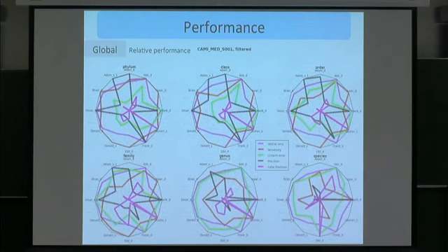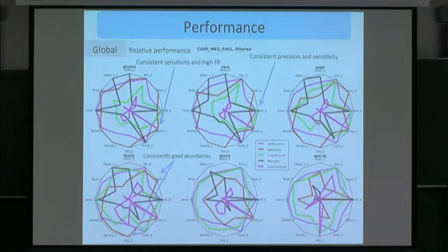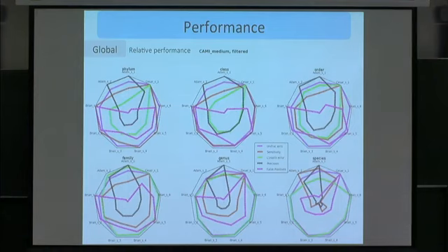Okay, moving on. Medium S1, sample 1, filtered across all of these guys. The same sort of general things that you're seeing hold true. Gustav again has most false positives, but also has one of the highest sensitivities. Hank is again the most precise, et cetera. So you can make those similar observations.